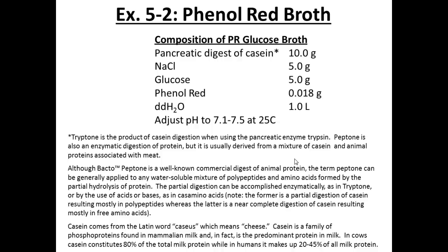Do you have a gas bubble in yours or not? No gas bubble. Well, oh, I know who does. Muhammad, you have a gas bubble in yours, don't you? And his is actually orange right now because, even though I put it in the fridge, I really couldn't stop his organism from starting to try, now that it's run out of sugar, to go to that protein.